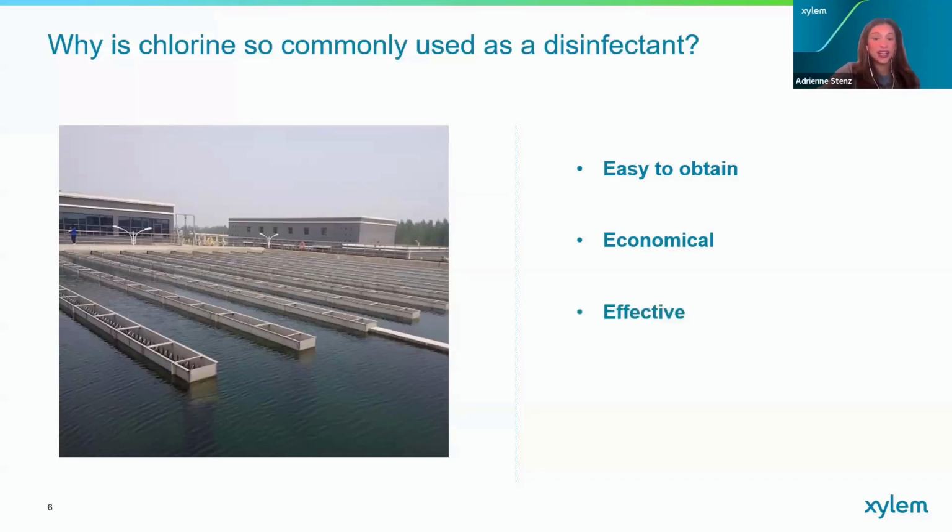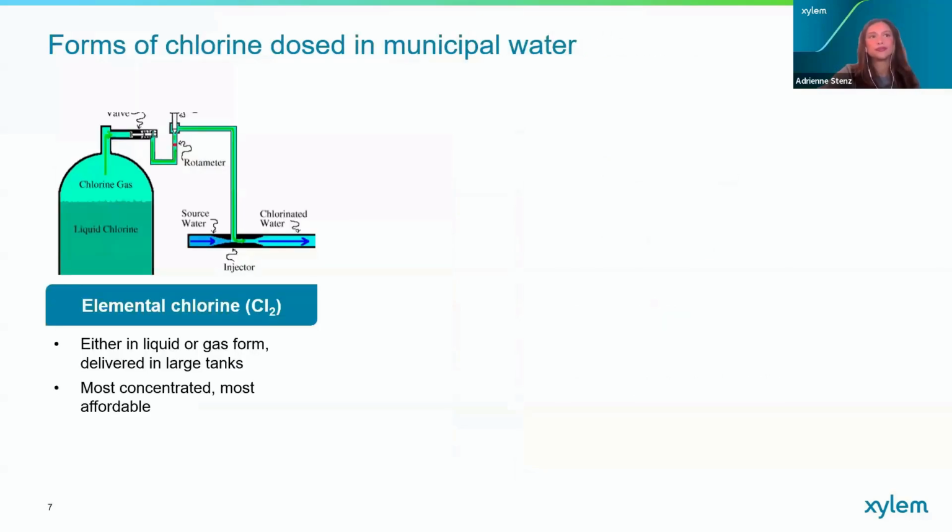It's also extremely effective. Chlorine kills a broad spectrum of bacteria in water and also provides a lasting residual or protective effect important for drinking water systems, preventing regrowth of microorganisms in pipes in the water distribution network. And lastly, chlorine disinfection is generally an easy process to implement. Chlorine processes do not require a large footprint, and the mechanical parts are generally minimal for maintenance.